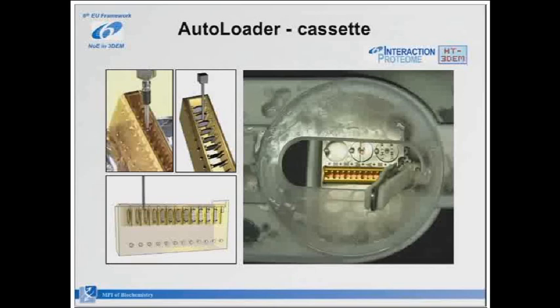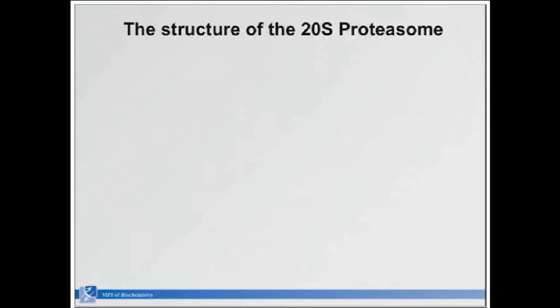So you see there's a lot of ice contamination here, and it's not a very nice transfer. And you can actually do good things with the microscope. That's what we tried in the beginning of this year to benchmark the microscope, because the idea is to have high throughput. You would like not to sit in front of the microscope and collect thousands of images to get the particles for single particle investigations or batch tomography.